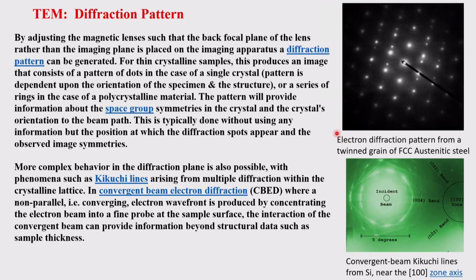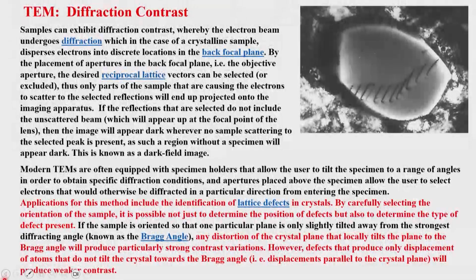The reason is some of these spots you're getting may not be from one single diffraction, could be from multiple diffractions coming in the same position. But these are all extra details, not necessary for this particular course, but necessary to mention the information. Okay, so we are talking about diffraction. Contrast we have already talked about.